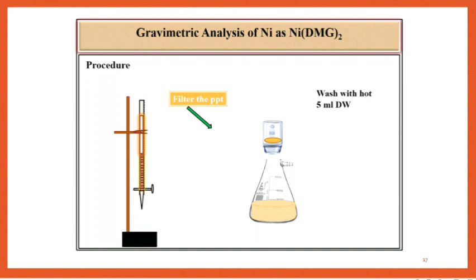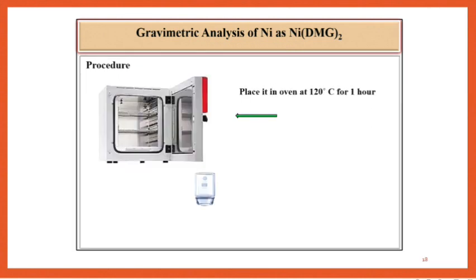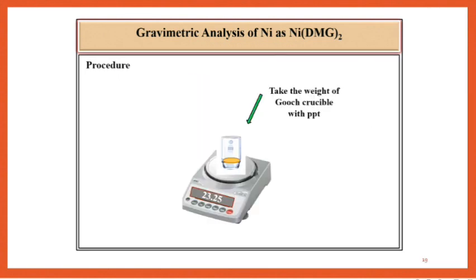Then keep the crucible in oven for 1 hour at 120 degrees centigrade. After 1 hour cool the crucible and take the weight of gooch crucible along with residue and record it in an observation table.